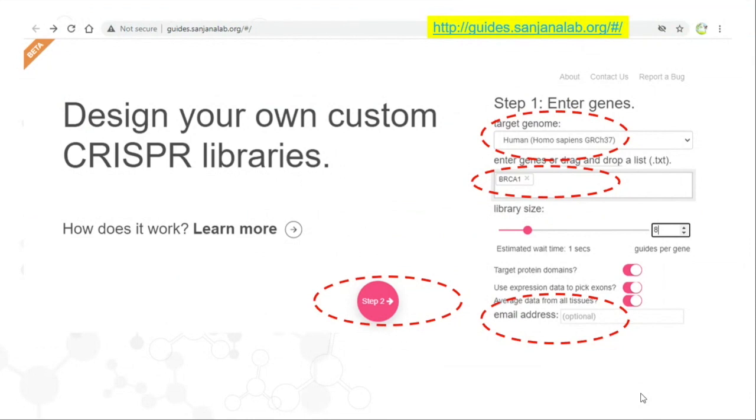When you click order directly, that is basically for American customers, because these synthesizers are already US based and have tie-ups with these labs. So when you click there, it will get all the shipping information on the next page, and there you can provide the information. That depends on your institutional contract with these vendors.